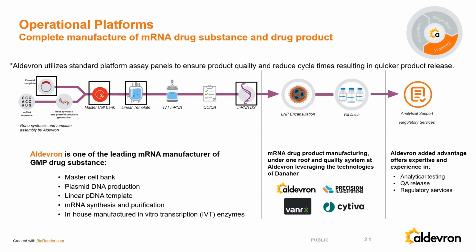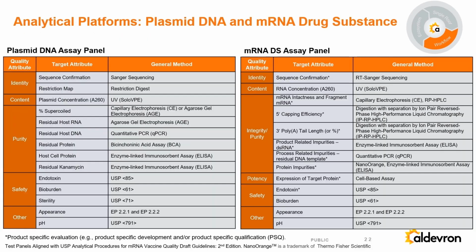And so what I've highlighted here is that we have certainly done this, and we've certainly validated platform methods to support the plasmid DNA, cell banking, the linear template, and of course the drug substance, which we'll highlight today with the use of SoloVPE for concentration.